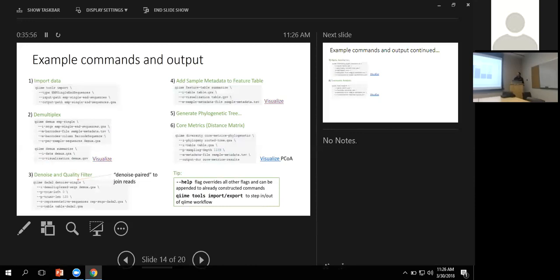As we keep going up, we're eventually going to lose all but one of the samples. Would you explain for those of us? Yeah, so it's basically when we sequence, we can get a different number of sequences for each of our samples, right? It can vary pretty widely. And so when we're doing our diversity analysis, we need to compare the samples on an even basis. So we would typically randomly subsample from each of those samples so that we have an even sampling depth for all of our samples. And that's the depth that we're specifying here.